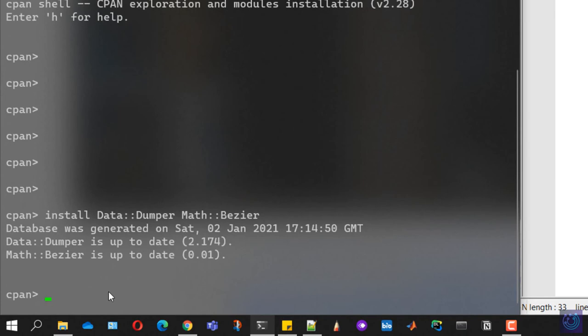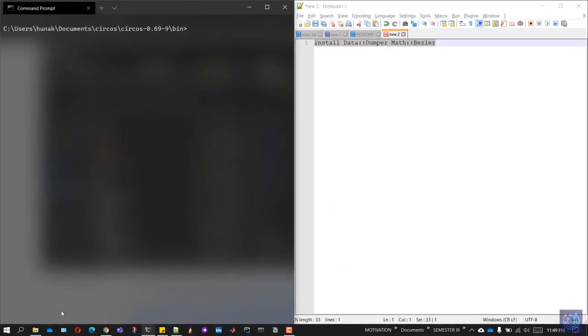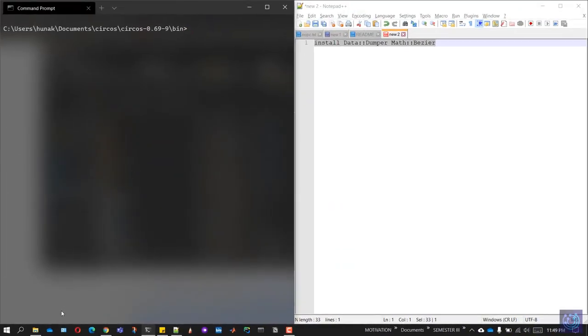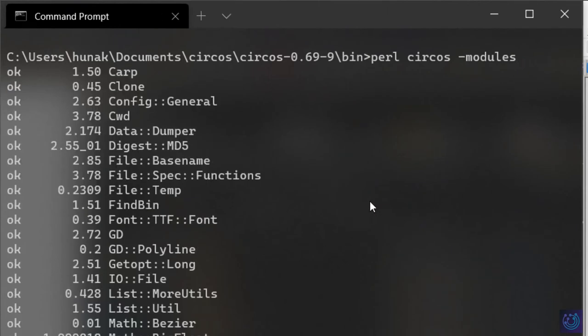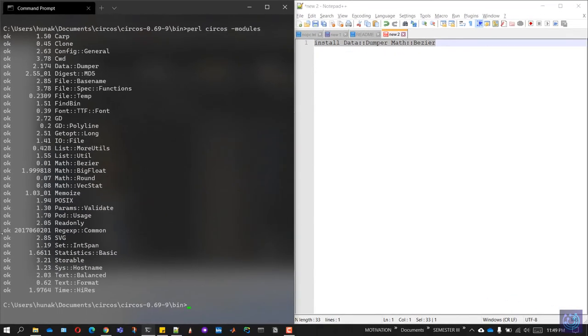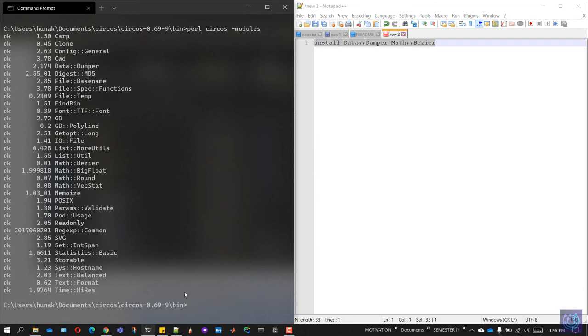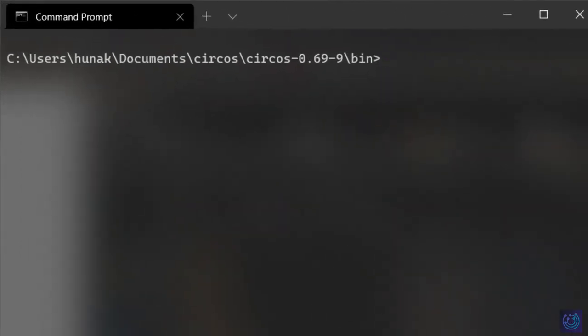Once that is done, let's exit this by typing in exit and clear the console. Now let's run that same command again: perl circos hyphen modules and hit enter. This time around, you should have all the prefixes as okay. Just in case you have something missing, try reinstalling it all over again. Once that is done, we will need to run one more command.